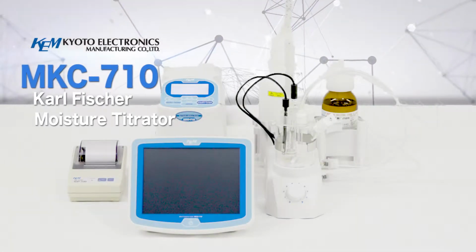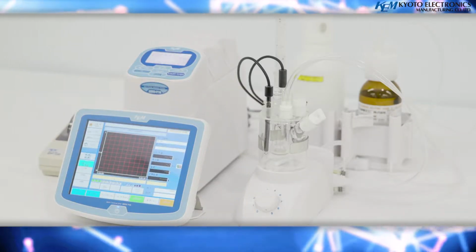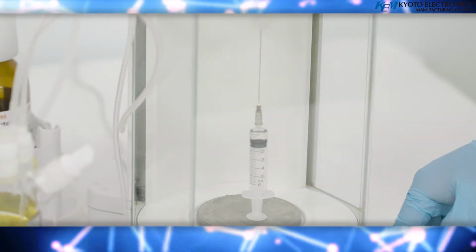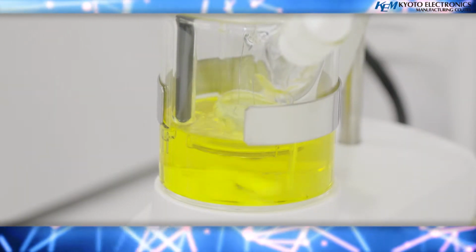Karl Fischer Moisture Titrator, MKC710. The MKC710 is widely used for determining the moisture content of various substances as a reliable moisture meter that has been adopted in many official analysis methods such as the ASTM, JIS, European Pharmacopoeia, and the United States Pharmacopoeia.